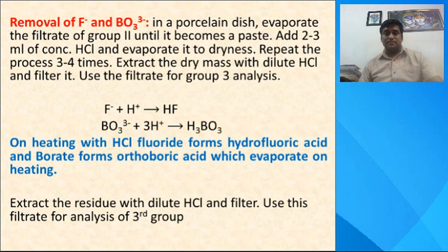There is a scheme, we'll see it later. Removal of fluoride and borate, same procedure. Take the group 2 filtrate in a porcelain dish, evaporate it till it becomes a paste, then add concentrated HCl.